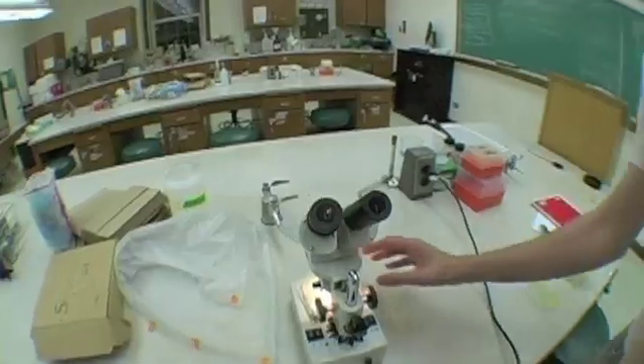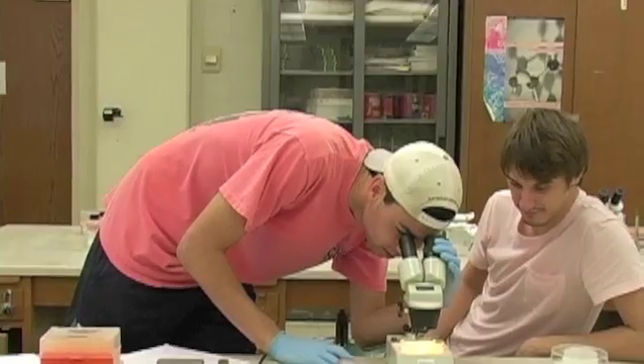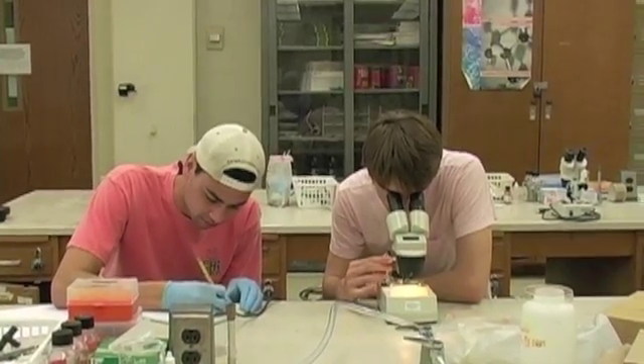Once you have picked the worm with your worm pick, place it on a petri dish with a food source. Please do not get upset or discouraged if you cannot pick a worm — this takes practice. Always make sure your lab partner checks to see if the worm is on the plate. Now that's a good job done.